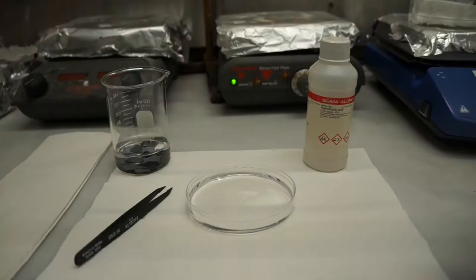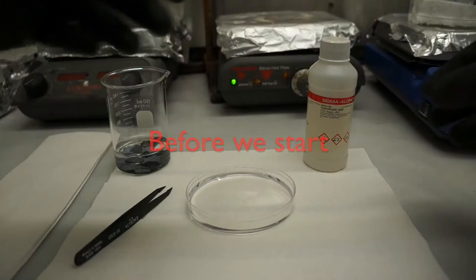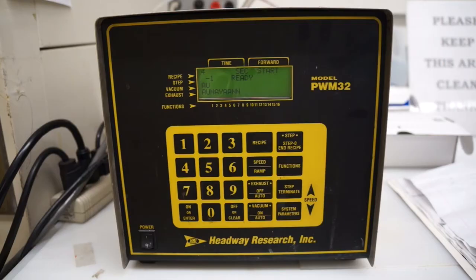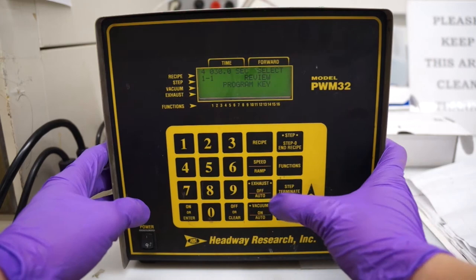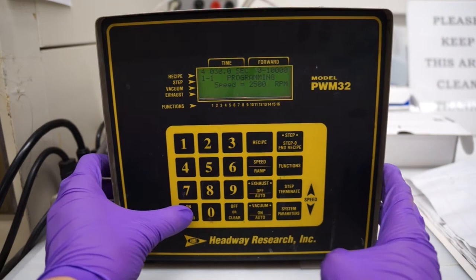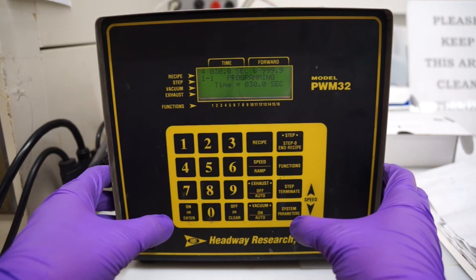The spin caster controller allows you to program the speed and duration of a spin, so let's go over how to program the settings that we need. First press step and one. Then speed ramp and plug in the speed, which is 2500 RPM and press enter. Then, press step terminate and enter the amount of time, which is 30 seconds, and press enter. Finally, press step and zero to return to the ready state.